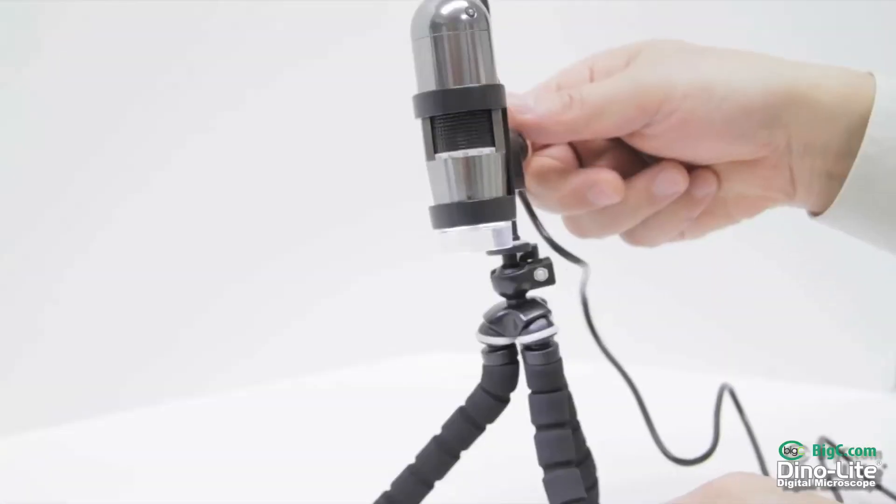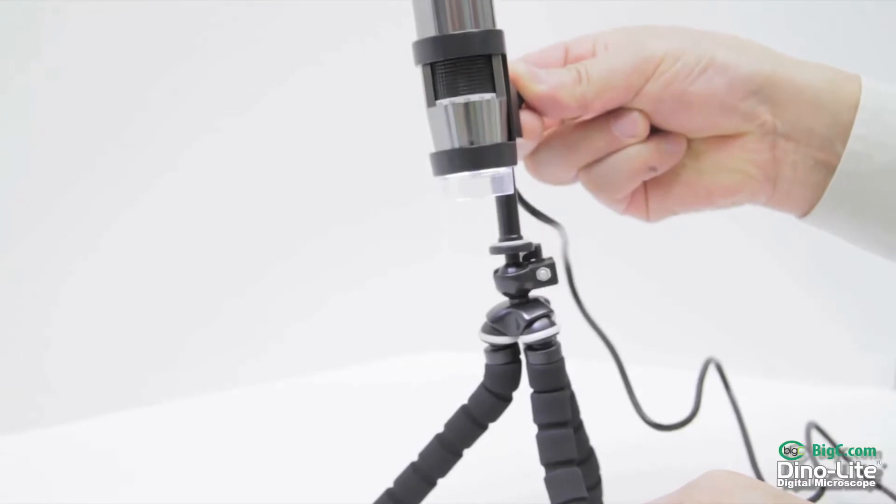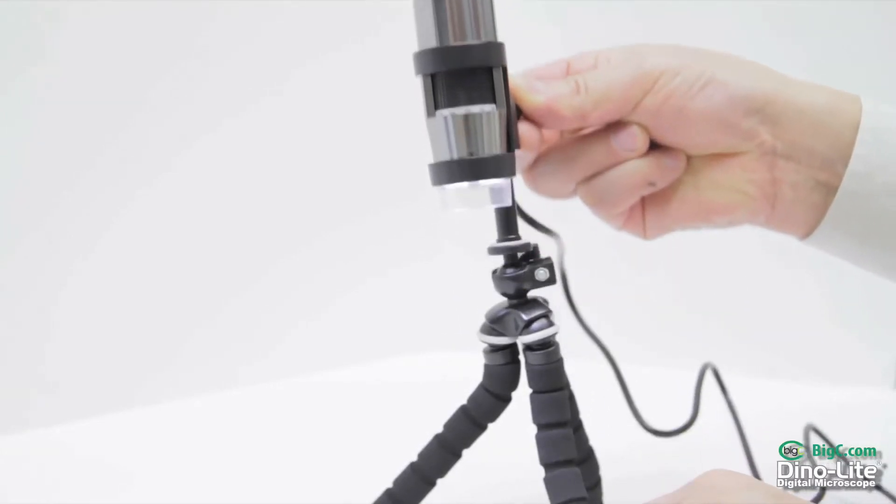This also has a ball joint pole mount for added versatility. By loosening the holster set screw, you can adjust the scope height.